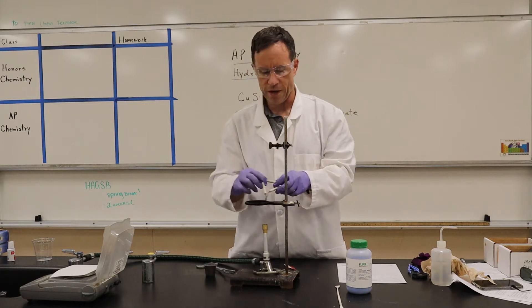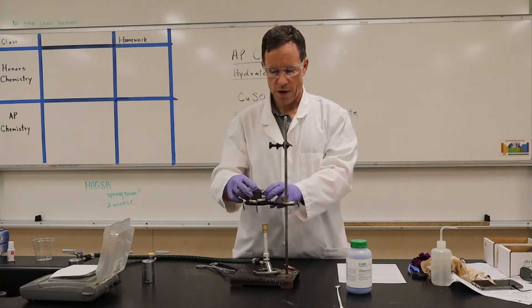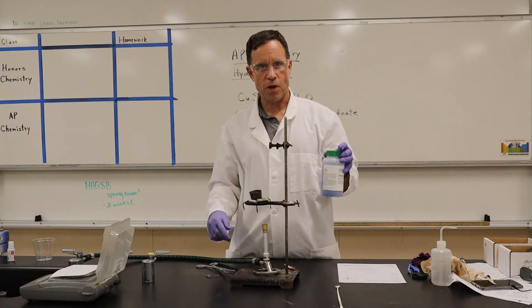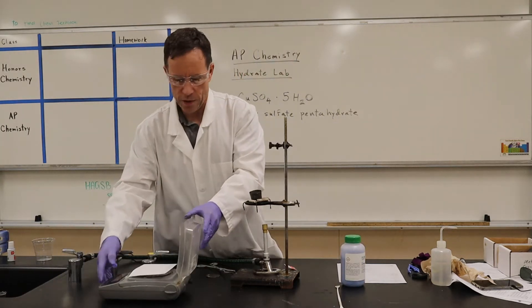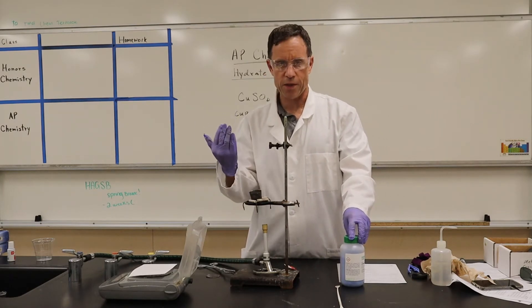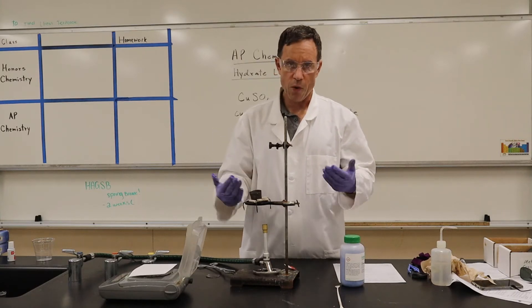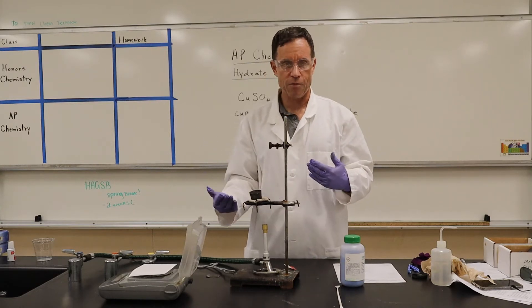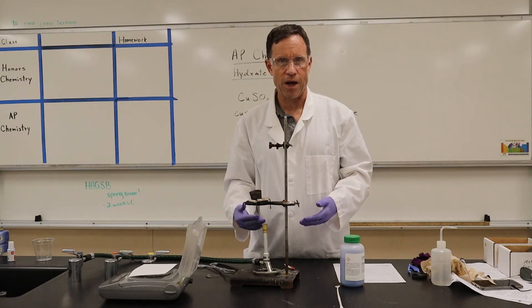This is called a triangle because it is three-sided. We're going to be putting our crucible in here. We're going to weigh out some copper sulfate hydrate, heat it up, and evaporate as much water as we can. Then we're going to calculate and see if we get a ratio of moles — hopefully, in a perfect world, a ratio of five moles of water for one mole of copper sulfate.